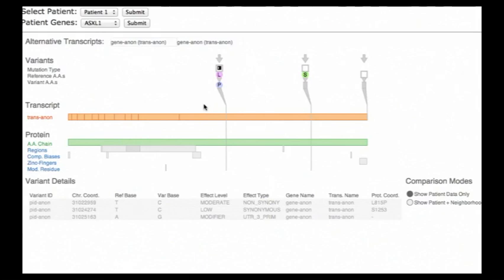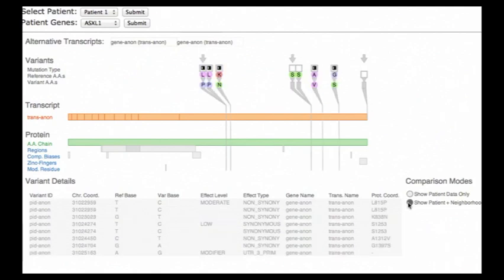We now compare the patient's data to the nearest variants from the known harmful dataset. The arrows mark the patient's data.